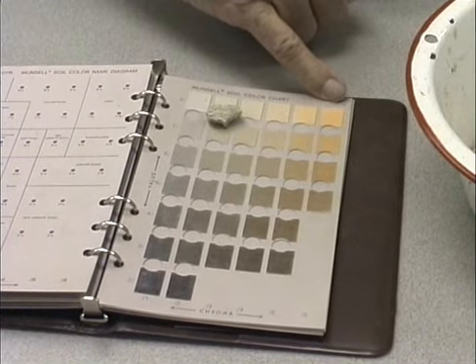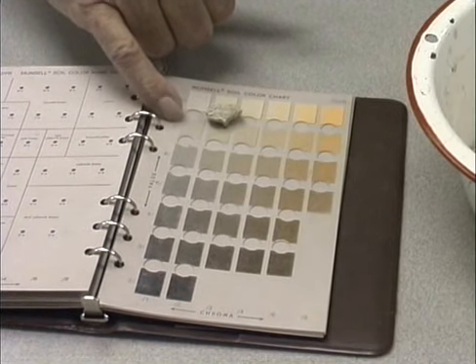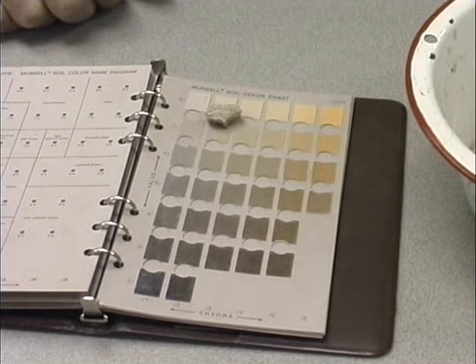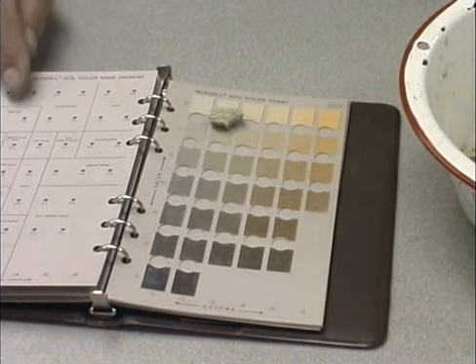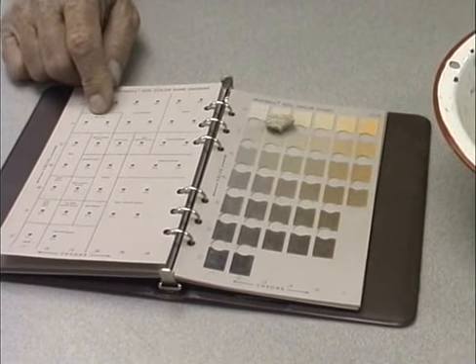So my hue is still the same, 10YR. My value, in this case, would be 7, and my chroma would be 2. This would be referred to as a light gray Munsell soil color.